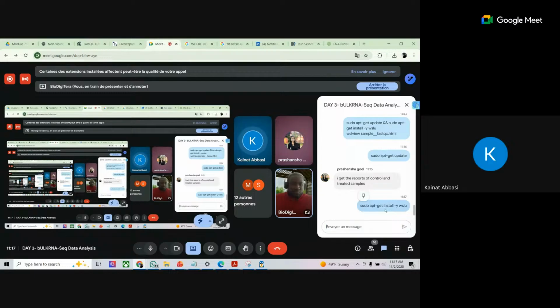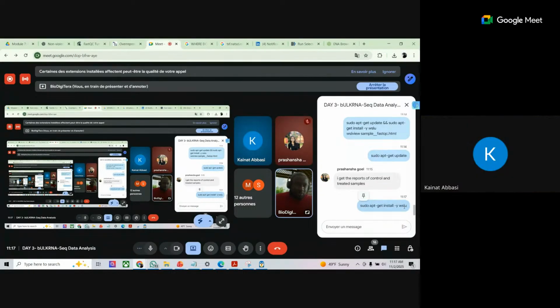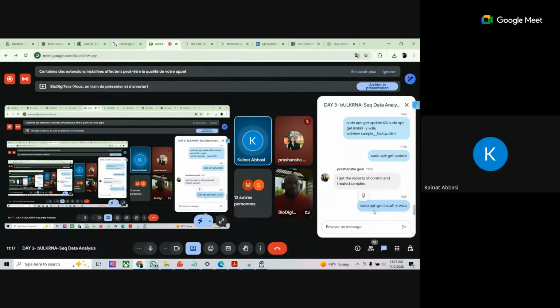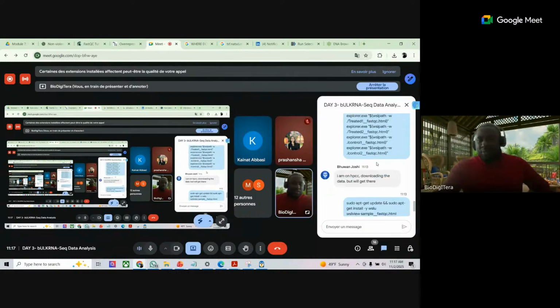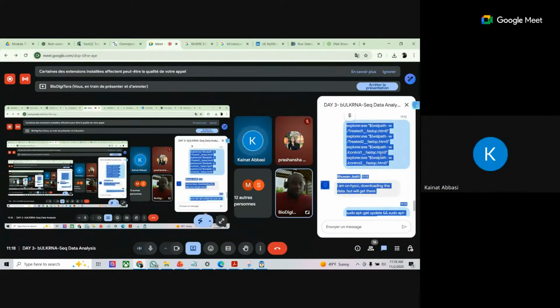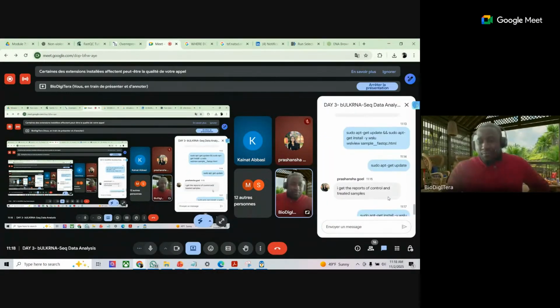The command is not working. It must work, it worked with me. It's not working on Mac. No, because it's asking for a WSL path and we don't have WSL. Okay, let me find the equivalent of this command for Mac. I don't work with Mac, I work with Ubuntu. You can find the equivalent online, just Google it. They will give you the equivalent of the same thing.